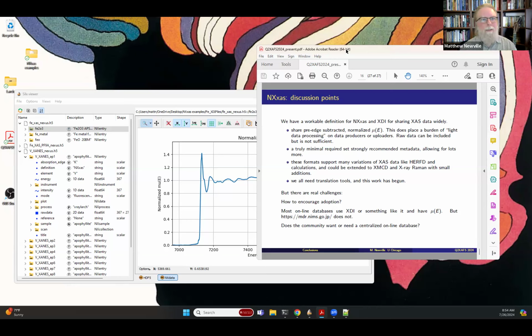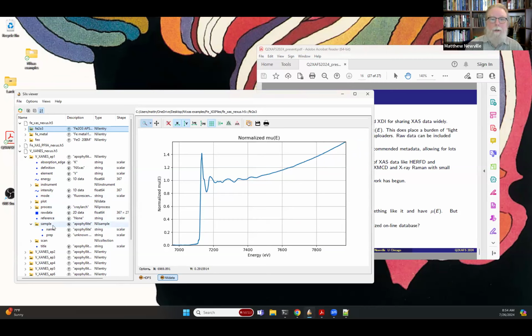I think it's quite possible to think of that as an extension for handling polarization. I would put that in the same category as temperature. That's a really important thing to know sometimes, maybe even more often than normal. We normally have it. So being able to say which orientations were available can totally go into the sample. I believe that some of the magnetic scattering definitions already have that built in, so we can just lift from there. Sample could have orientation, and the instrument can have a polarization vector. Those are supported in other NeXus definitions.